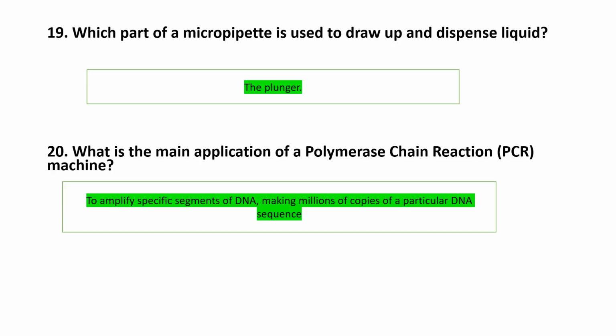So it is an amplification method. Remember, in a molecular biology lab, in an advanced one, you can start with the DNA extraction. This is where we actually isolate nucleic acids, by the procedure that we will be given. I'm going to explain that later. And then we have the plating method, and then we have the amplification, which is by using the PCR. We're going to discuss all these under this procedure. This is actually the end of the short answer questions that we had today.